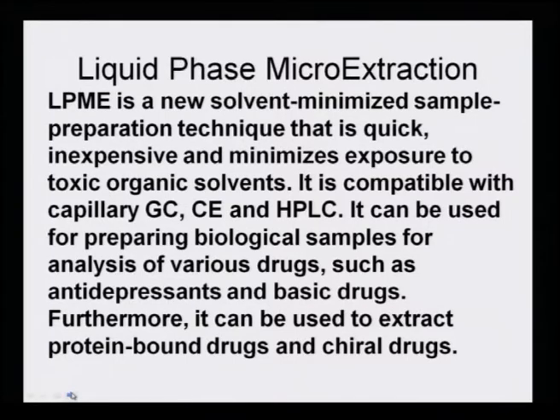As the word micro would be very well understood by you all, it relates to smaller and minute quantities of the analyte being extracted. So, it is a more sensitive process than the ones which I have mentioned earlier.